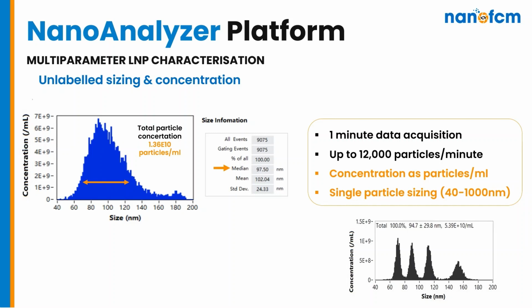When we look at the sizing in nanometers, it's based on the scattering intensity like we saw in previous slides, and what we use is calibration tools that we provide. We see here our 4-point calibrator, the S16M EXO standard. These are mixed silica beads that are individually sized at 68, 91, 113, and 155 nanometers.